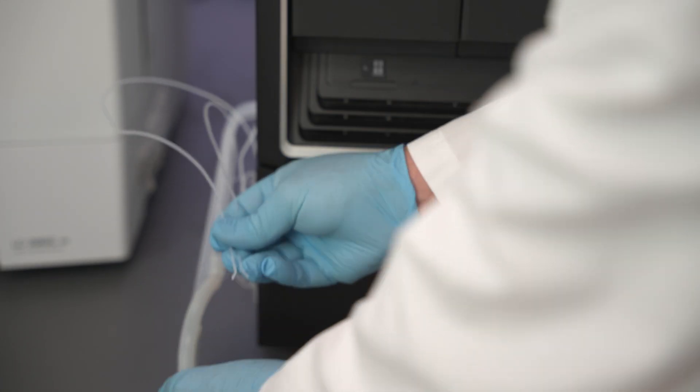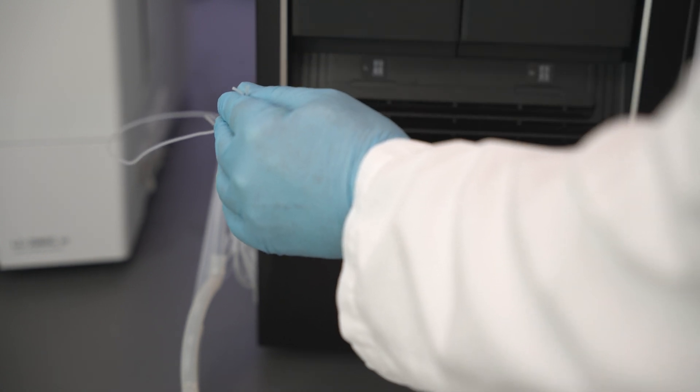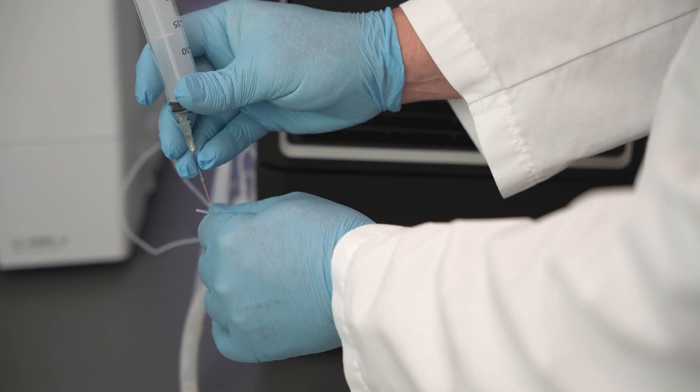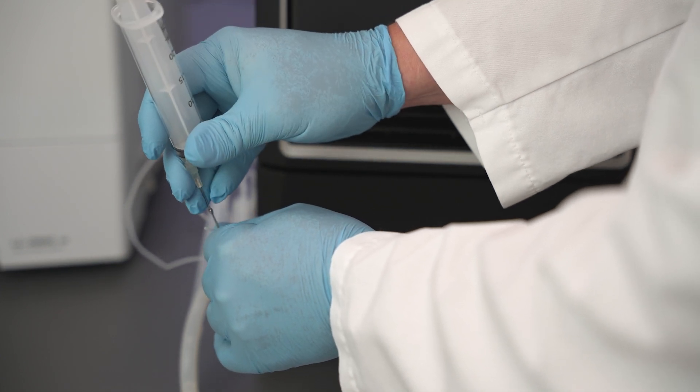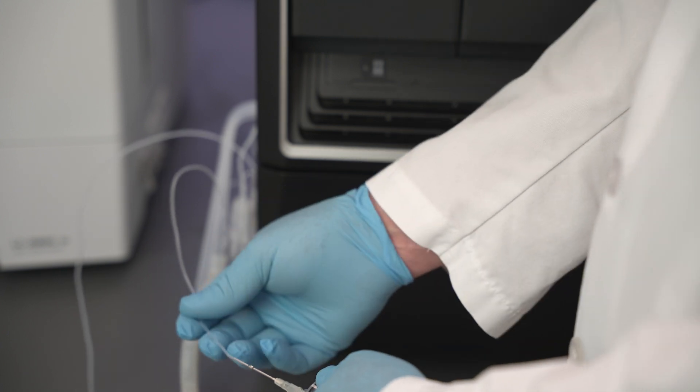The two waste tubes coming directly out of the instrument are from the pump and the detector. The waste tube for the pump has a slightly larger diameter than the tube from the detector. Insert the needle and attach the syringe to the end of the pump waste tube.